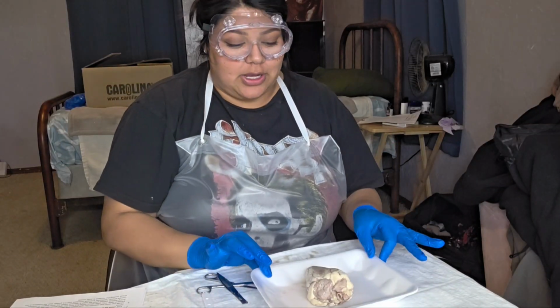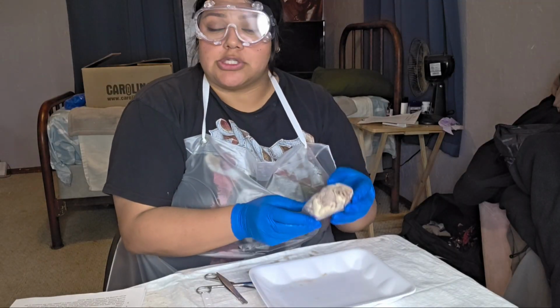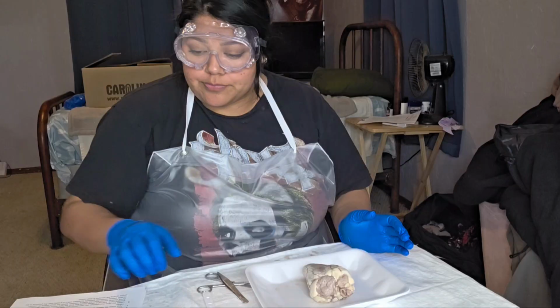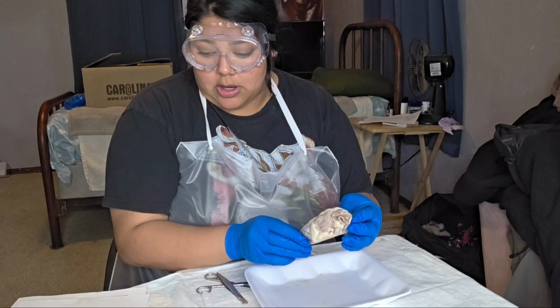Hello, my name is Leanna McGrath, and today I will be dissecting a sheep heart. It's very close in anatomical structure to that of a human's, so it's a great opportunity to learn. So first, we are going to examine the heart and locate the thin membrane, the pericardium.